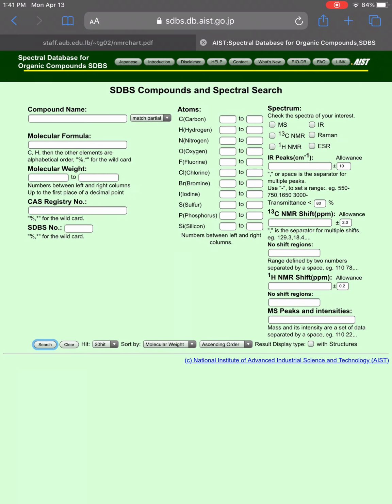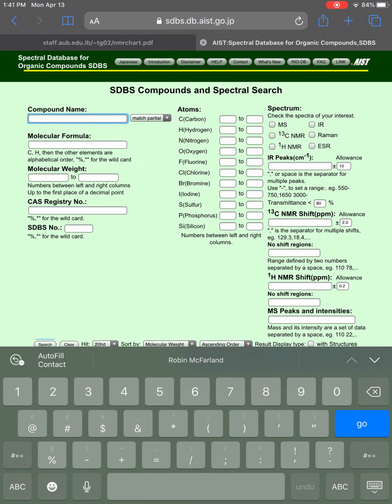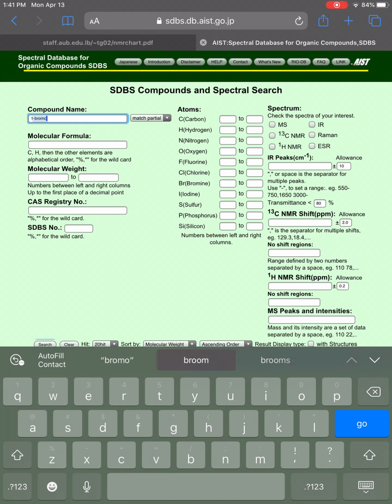All right. So I'm going to pick one here. I'm going to put into the search bar 1-bromopentane.